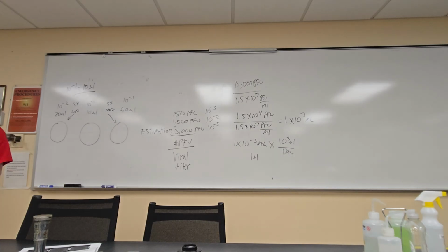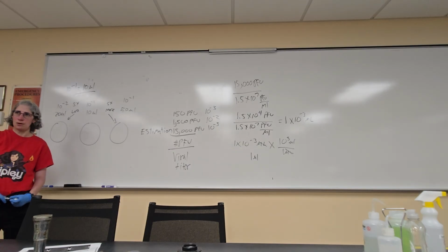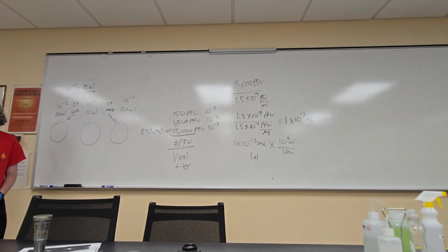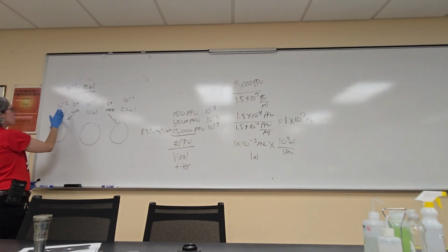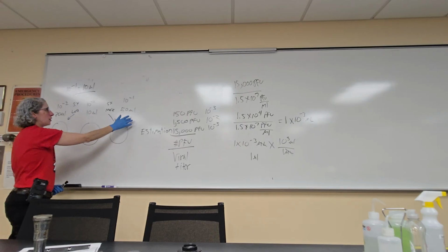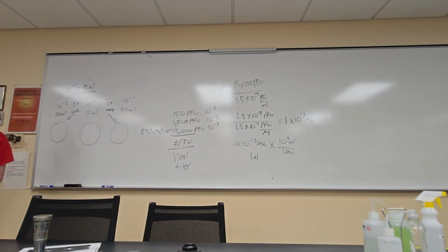Okay, so now you have your estimated volumes that you're going to use to bracket your plates. So you'll need to make a zero dilution that goes up to the 10 to the minus 2, and then you're going to infect your cells. You'll have 1 tube using the 10 to the minus 2, infecting with 20 microliters, 1 tube using the 10 to the minus 1 and infecting with 10 microliters, and a 3rd tube where you'll use the 10 to the minus 1 and infect with 50 microliters.